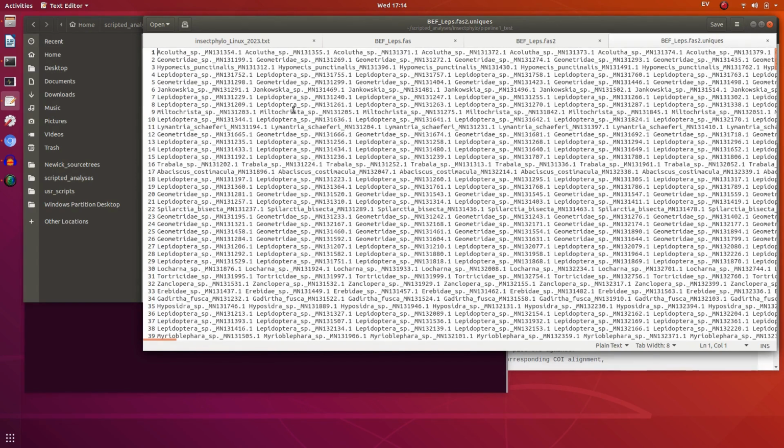So this is much more efficient data if we can just take one representative per OTU. Much more efficient to analyze this data, but importantly we don't totally disregard other members. This is because many of these are other representatives of a species and present, say, elsewhere in the plots, and we still need to integrate these into the analysis later. But for now we'll just take a single sequence for each of these OTU.